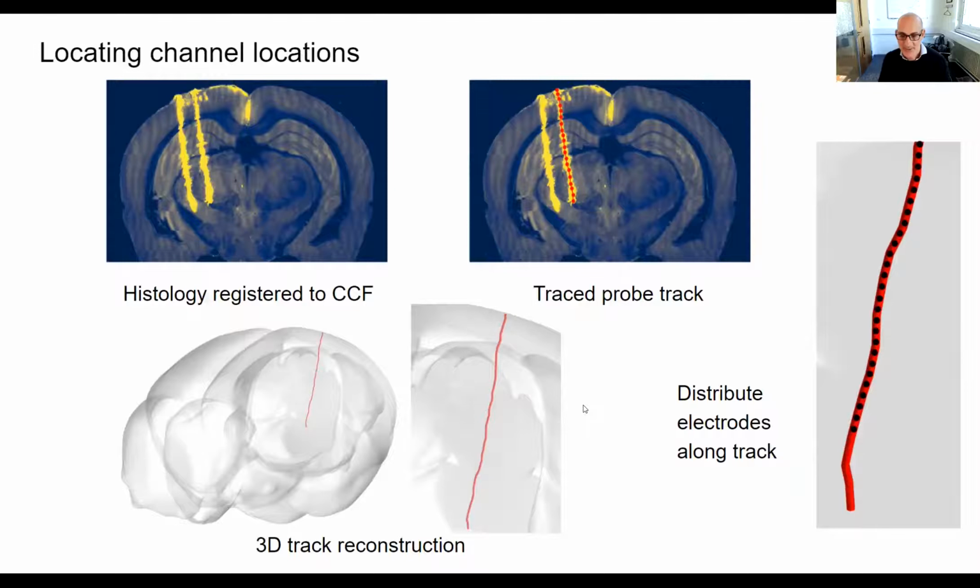I suspect at this point some people are wondering, why is this not a straight line? I think this is due to the manual tracing step. The way this probe was traced was in Lasagna, the software that Stephen mentioned earlier. The idea is you manually click on the trace, scroll through the stack, click on the second trace, and then it creates a line of best fit, or a curved line of best fit, to those trace points. So that's why it's not a completely smooth track.